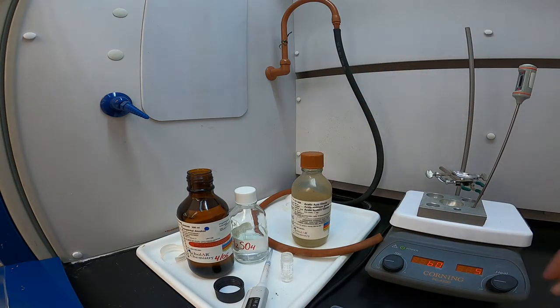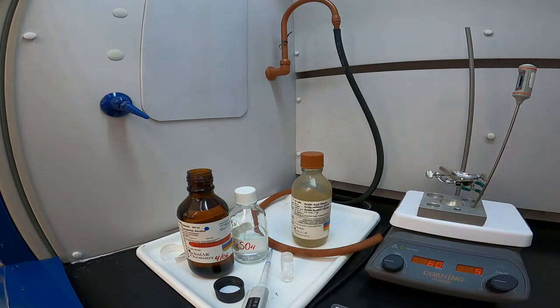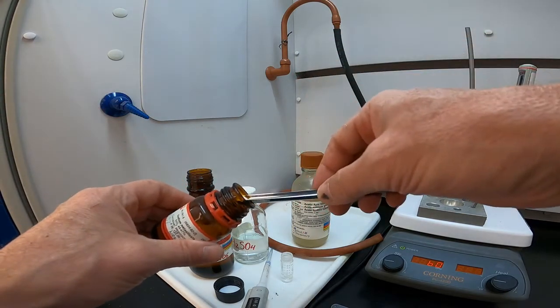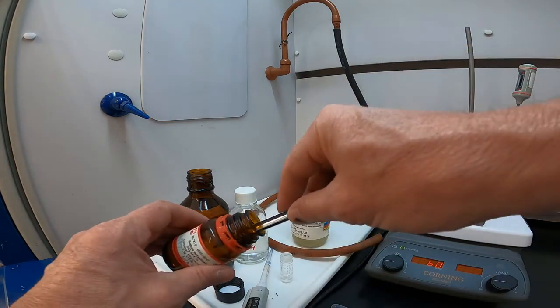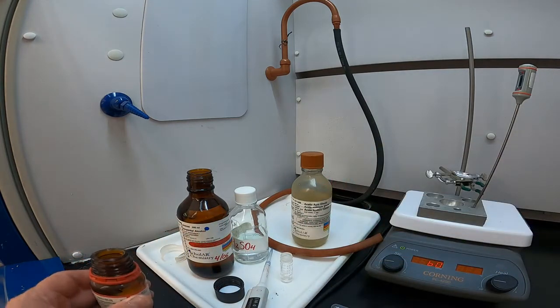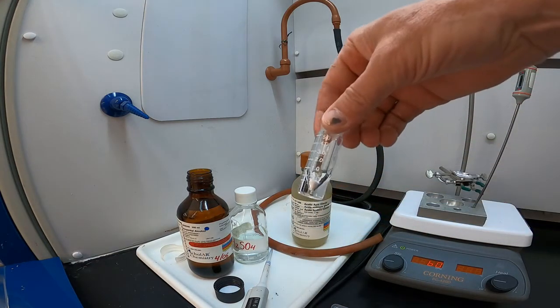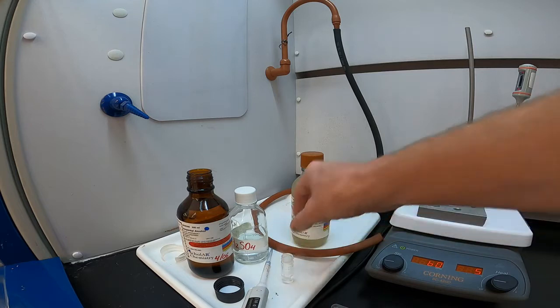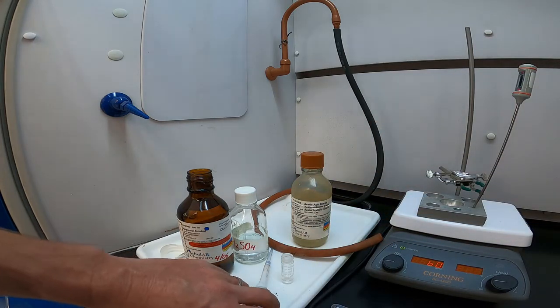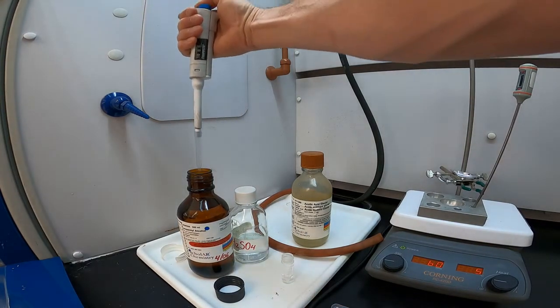So then we also added to the reaction vial a small amount of SiO2, or just essentially silica. And what that does is absorb moisture in the reaction so that it doesn't impact the product creation. So I put just a small amount in there. It says about 0.3 grams, and I just eyeballed about 0.3 milliliters to assume it's close to 0.3 grams. So then next I'll add the 1 milliliter of isopentyl alcohol.